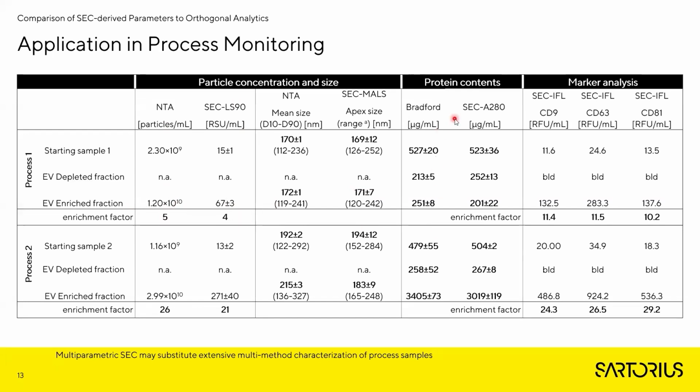The protein estimation from SEC analysis shows the same trends as analysis obtained from Bradford. And here we also see the evaluation of enrichment for different EV markers was quite comparable for the three probes.